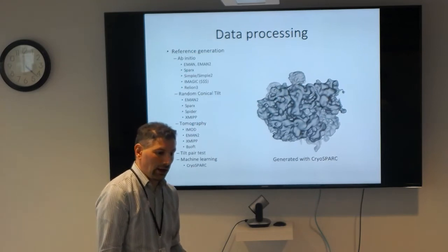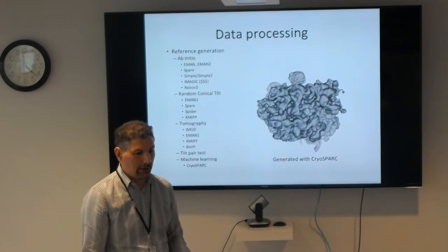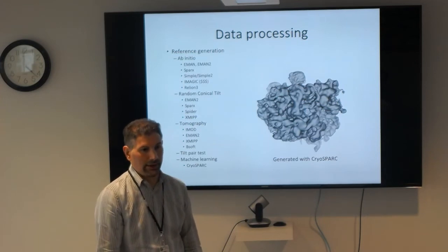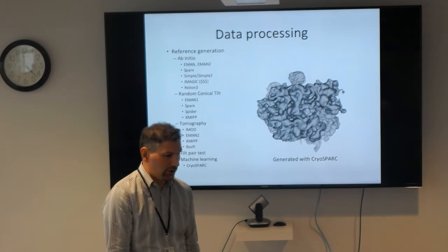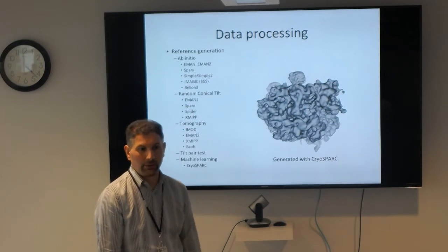Okay, so because of that, every once in a while I bring my routines out and use them, and Spider is like the only way of going at it. But then you have to have grown up knowing how to write scripts for Spider. If you can code, then you'll pick it up no problem. If you can't code, it's going to be a little bit problematic.